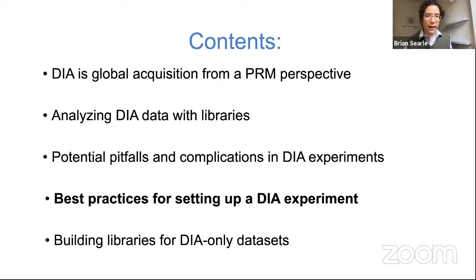Sumit asks, can you use something like iTRAQ with DIA? Reasonably, you cannot, actually. iTRAQ and DIA are pretty much not compatible. You could potentially, theoretically, use something like complementary TMT, but there's a lot of research that needs to go into that type of work before you could actually do something like that. You definitely can't use normal iTRAQ because all of the quantitative information is essentially lost, since you're actively seeing co-eluting isobaric peptides at the same time.